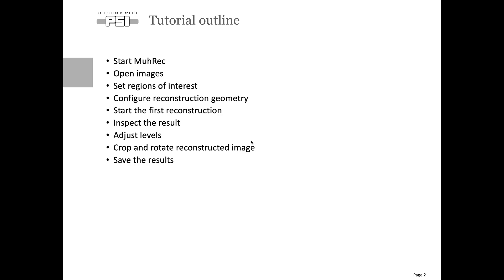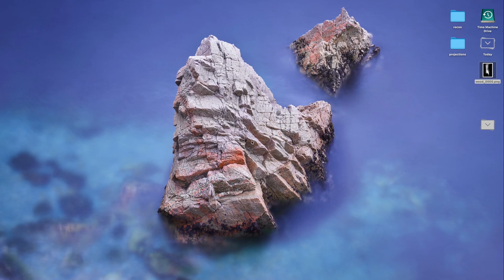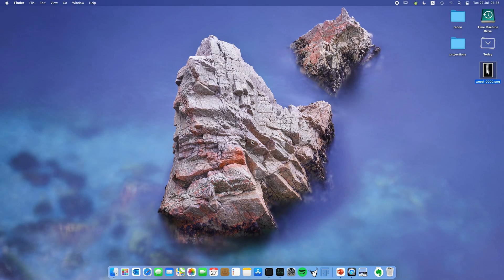Next is to select regions of interest followed by configuring the reconstruction geometry. After that we're ready to do our first reconstruction and inspect the results. There we may need to adjust some levels, also cropping and rotation could be relevant. Finally I'm going to show you how to save the results. With that we can start now.